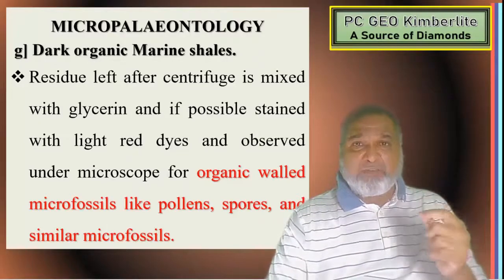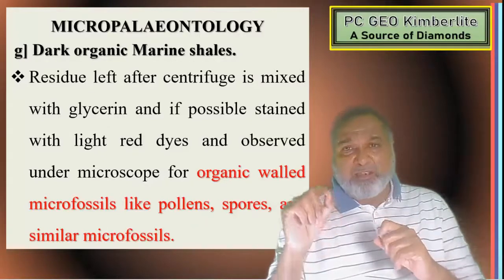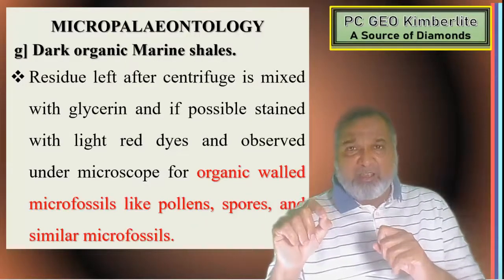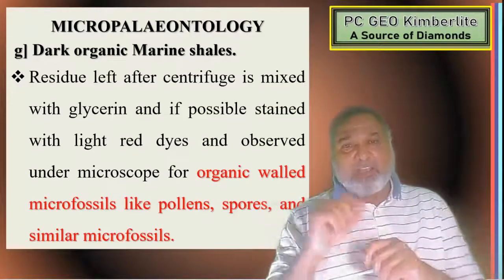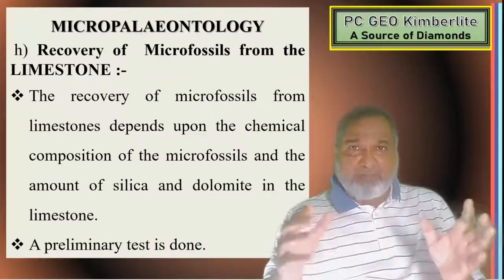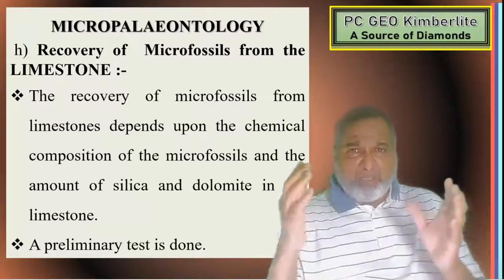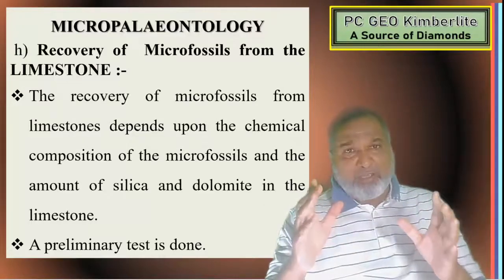The residue left after centrifuging is mixed with glycerine and, if possible, stained with light red dyes and observed under the microscope for organic walled microfossils like pollen, spores, and similar microfossils. Recovery of microfossils from limestone: yes, 100% this will be in the examination as a write a short note, so those who are there can prepare.